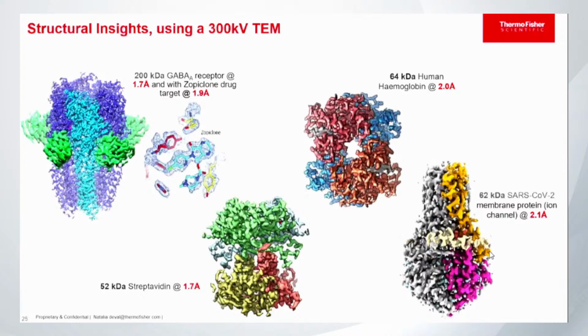The resolution is going to be much better at 300 kV versus 200 versus 100, okay? So if you are really pursuing the maximum resolution you can get, the 300 kV will be the best option for you guys. But again, it depends on the project, and it's always heavily sample dependent, okay? Depending on your sample as well.